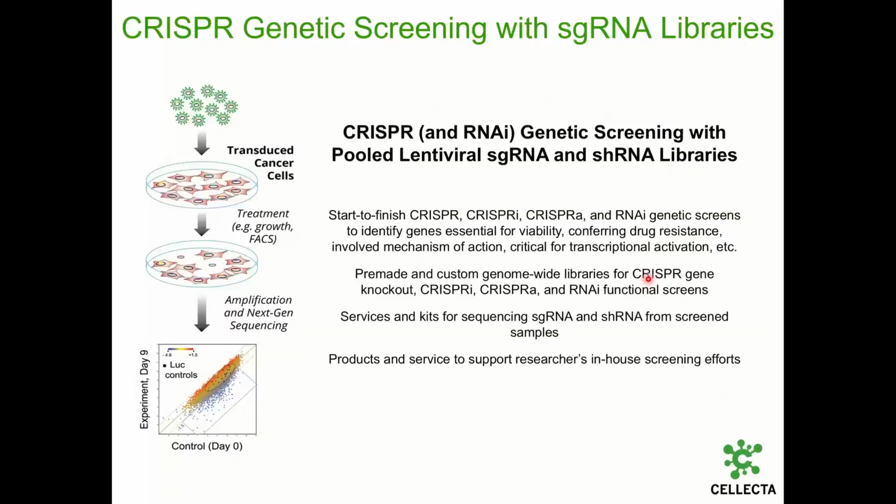While DRIVE-MAP and other expression profiling techniques provide an understanding of which genes are up and down regulated in conjunction with changes or the presence of different phenotypes in different samples, transcriptome analysis does not tell you which genes are actually important for driving phenotypic changes. Which genes are activated or deactivated that are important for the biological changes of interest. Addressing this question requires disrupting or perturbing particular genes to see if they have an effect on the phenotype of interest.